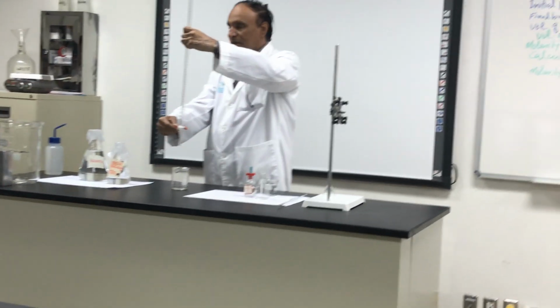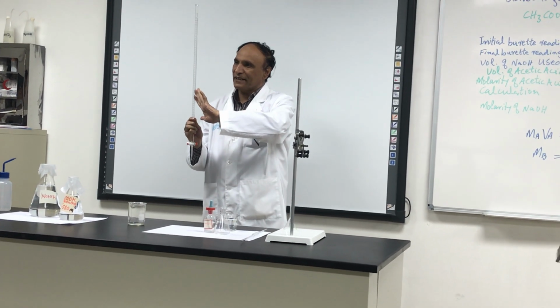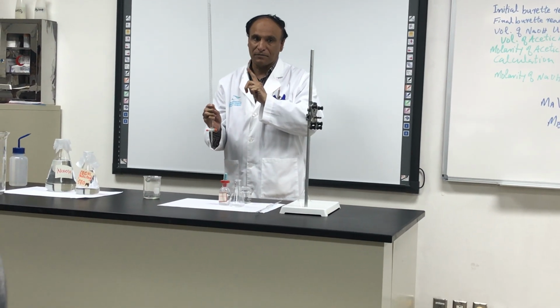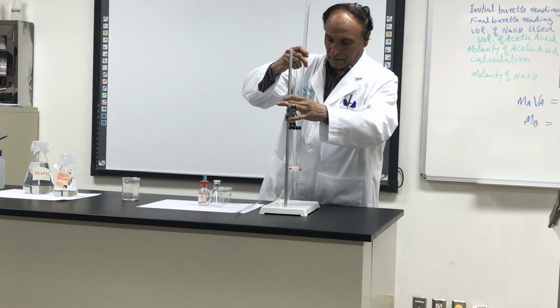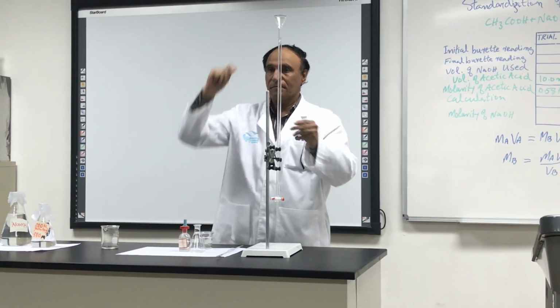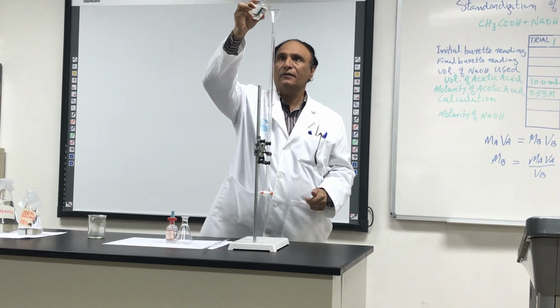Now this is washed with sodium hydroxide. Okay, now this is ready. It's washed with sodium hydroxide. One student will do like that, as I am doing, not the other student. Then the same student will put the funnel over there and fill it with sodium hydroxide.